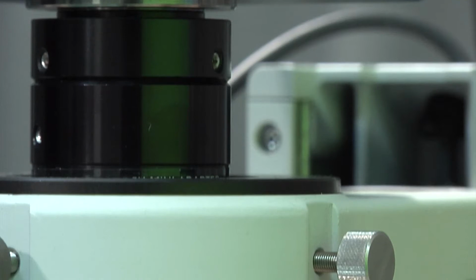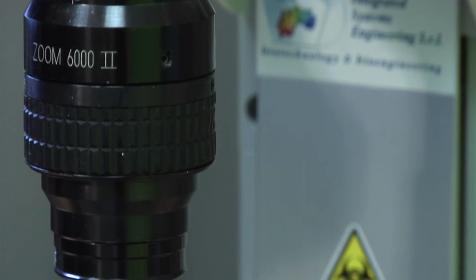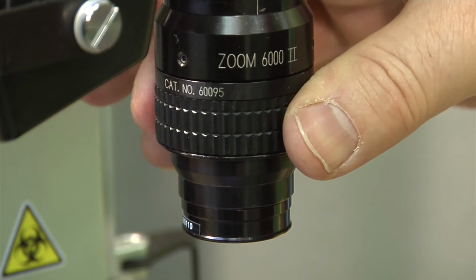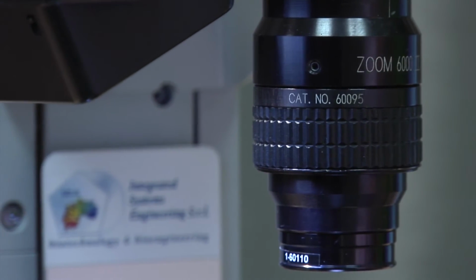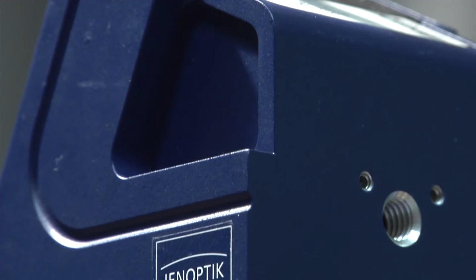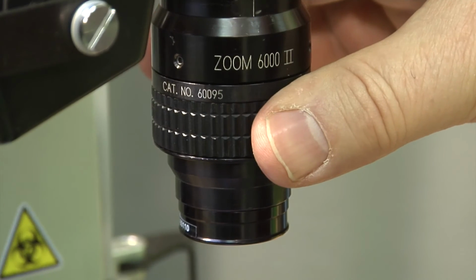On that stand we mount optics modules from Navitar. We mount 4 modules to be flexible and to leave to the operators enough space for working, so you can put your hand freely in the space under the objective. We have also a camera for sending images, live images, to the computers, and you can see on the image, that is a 22-inch monitor, the image from the camera. You can also have a zoomed image up to 50 magnification, so I think it's really enough for making a good job on that.